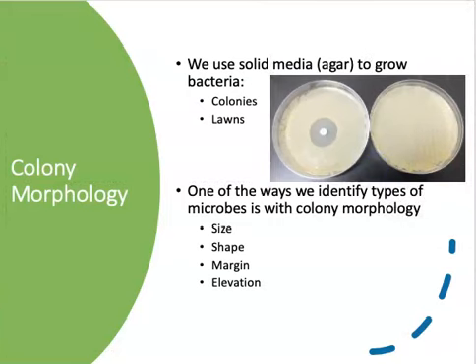Now, many other times we want to grow colonies, including the times that we're trying to evaluate colony morphology. Colony morphology, or the body form of a bacteria growing as a colony, is one of the traits that we can use to identify bacteria. In other words, each species of bacteria has its own colony morphology. When it grows as a colony, the colony will look a particular way.